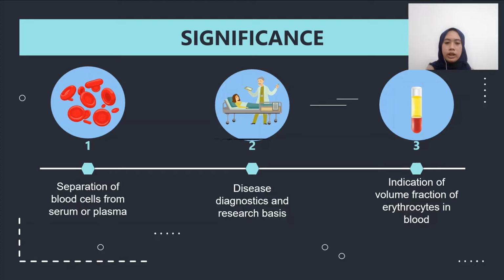The blood bank utilizes centrifugation process for antibody screening, cell washings, and tube typing. Centrifuges are also used in coagulation department to obtain platelet-poor plasma.